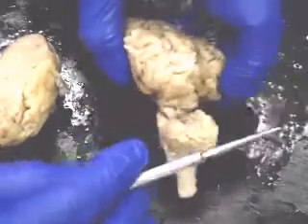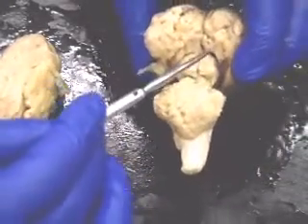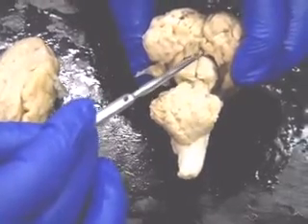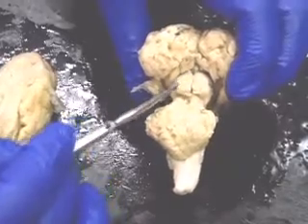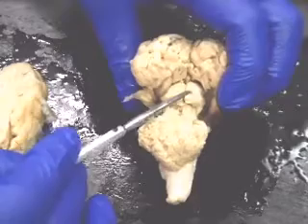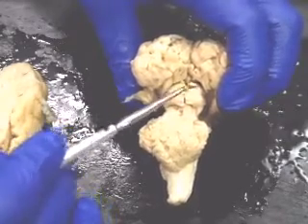If I turn the brain this way, we can see an area right here, and this is known as the pineal gland. The thing that I'm moving right there is the pineal gland. Below the pineal gland is called the corpora quadrigemina. So that is the corpora quadrigemina.